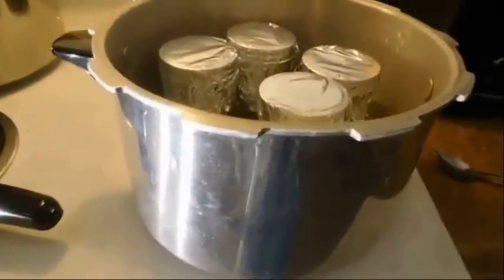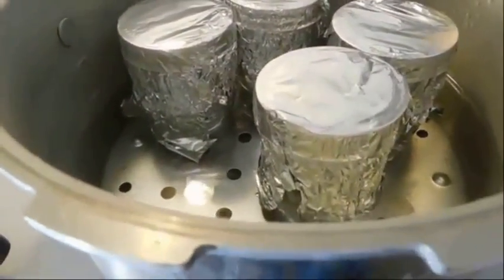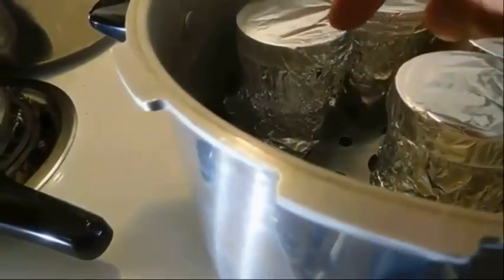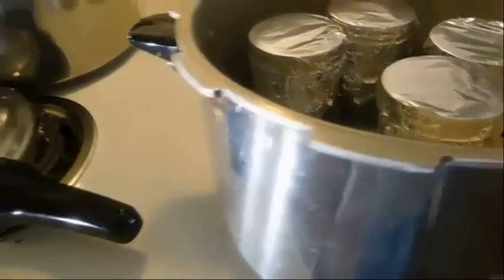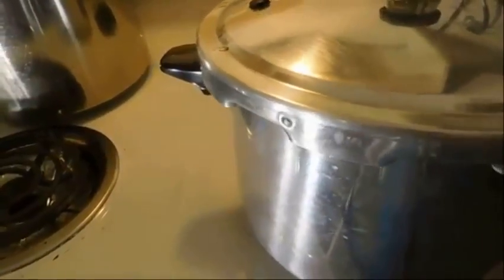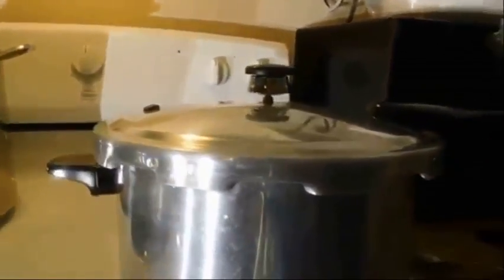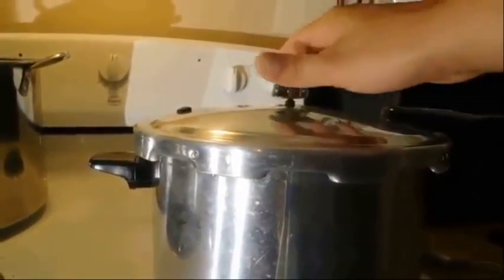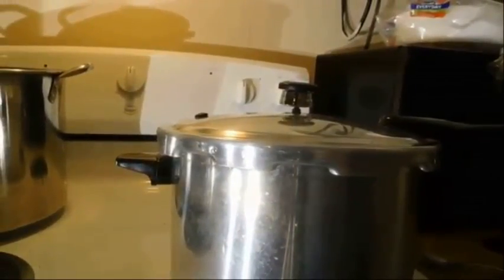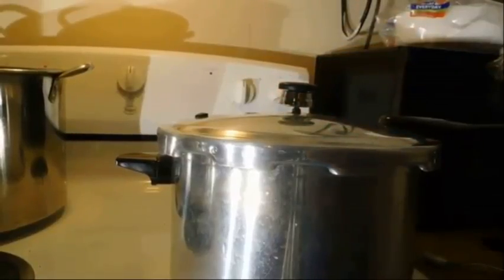Now that everything is in the jar and done simmering, fill the pressure cooker with two to three inches of water from the bottom — don't fill it too much. Put the lid on and pressure cook the agar for 15 to 20 minutes at 15 psi. Once it starts rattling and making noise, count down 15 minutes. If you want to be extra careful, go 20 minutes. Turn it on high and we'll come back once everything's said and done.